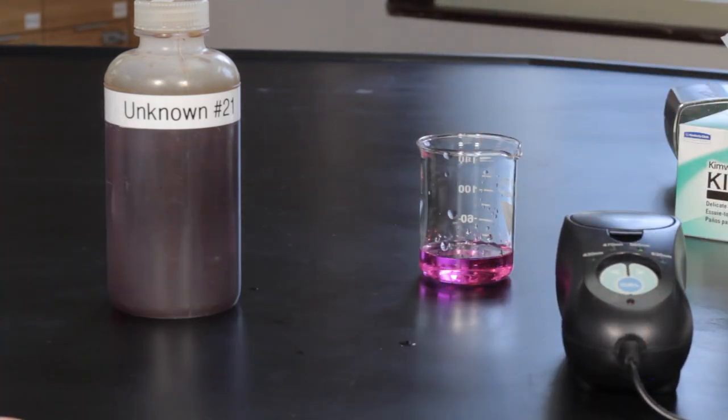Remove the cuvette from the cell wall and rinse both cuvettes thoroughly with distilled water. Switch the colorimeter wavelength selector button to the off position. Clean the glassware and put away the equipment.